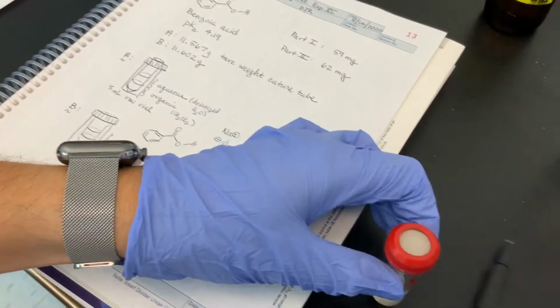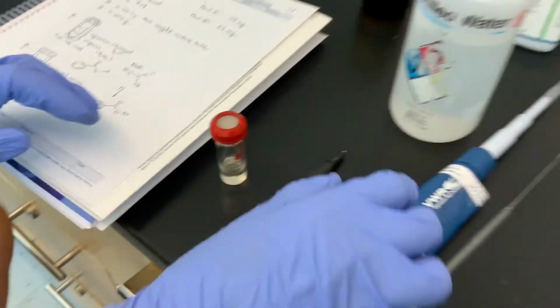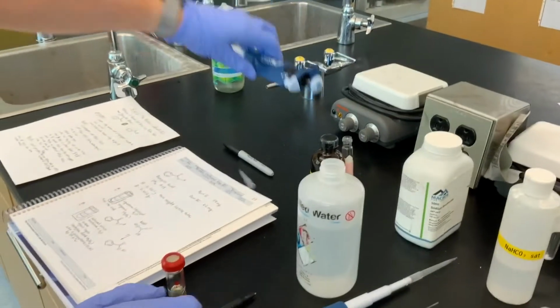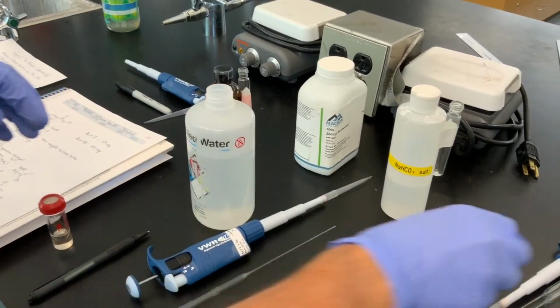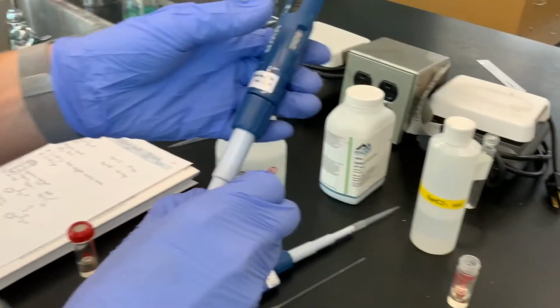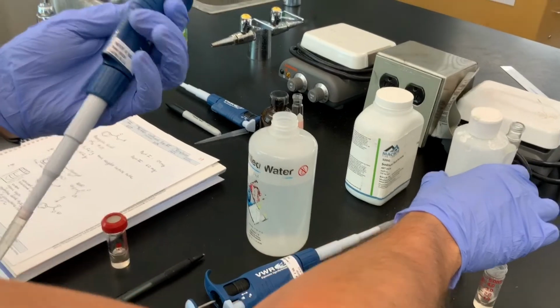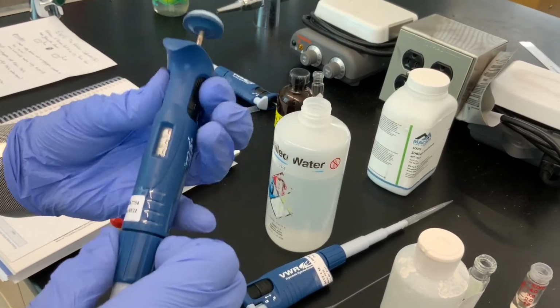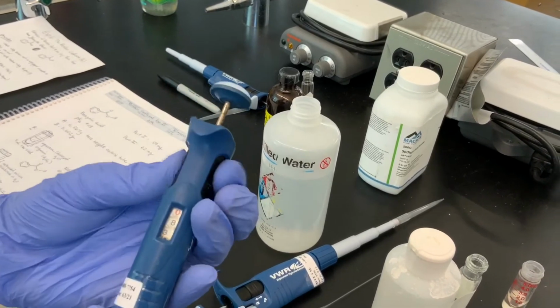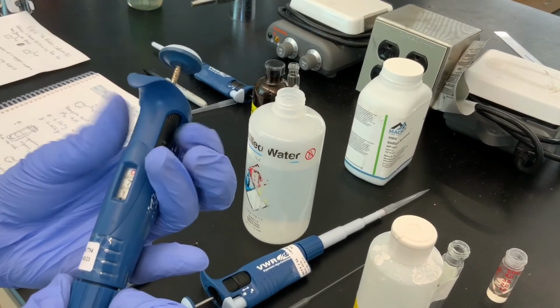We're going to use a different autopipetter, because this one's for methylene chloride, this one is for deionized water, and we don't want to contaminate them, so this one we'll use for the sodium bicarbonate. And of course, we're going to check that we've got 600 microliters.